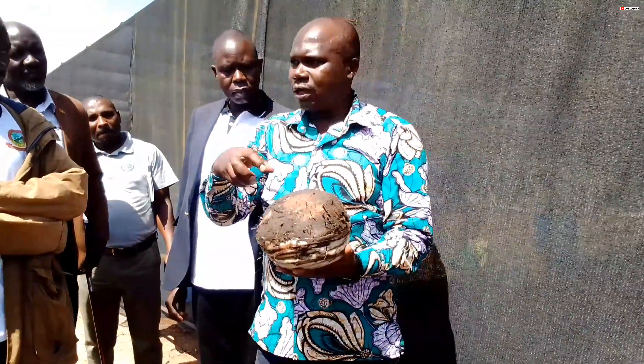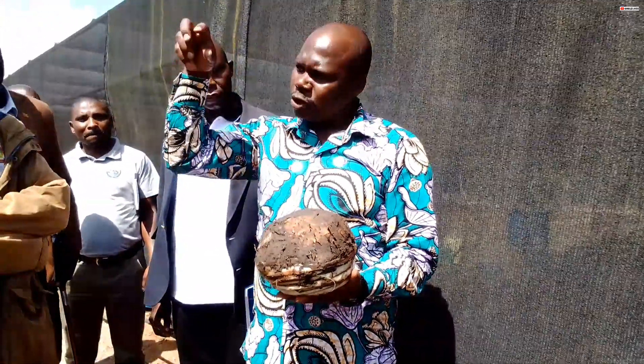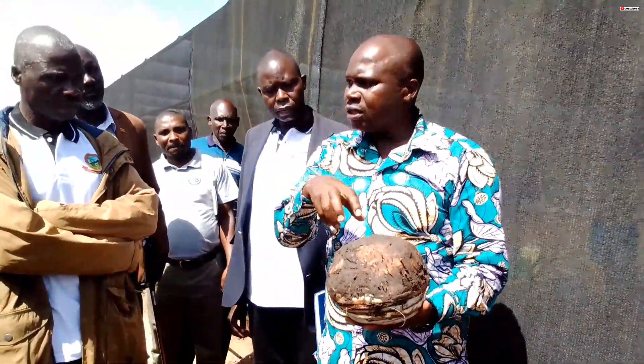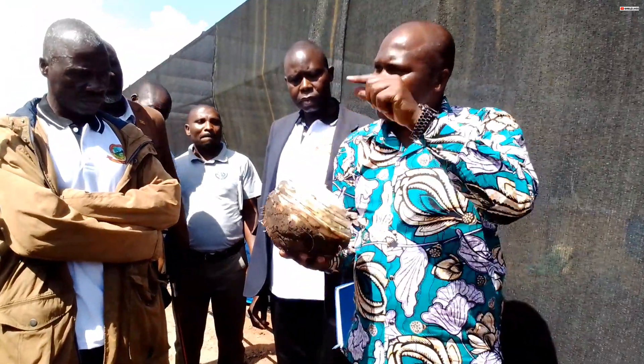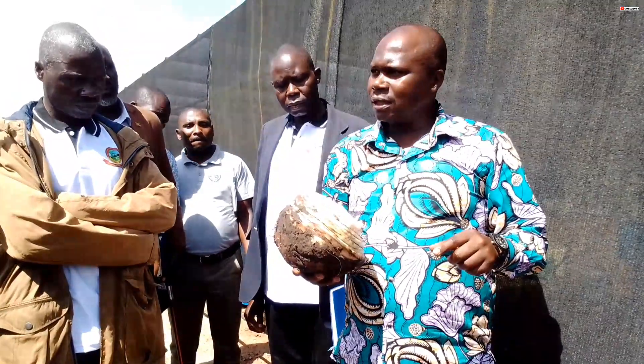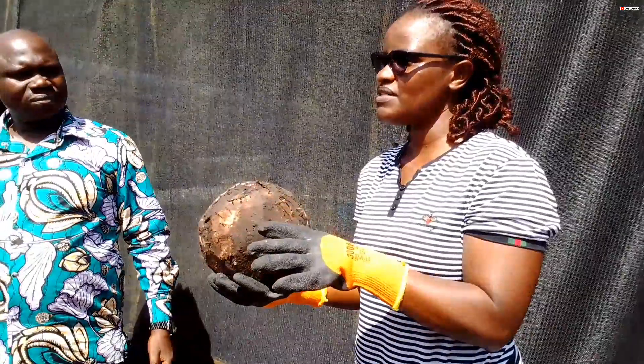When you look at those combs, there are some which have tunnels or holes that have been made by banana weevils. So there is a possibility that there are even eggs inside this one. That's why we are disinfecting it. But even when they are preparing, we make sure we don't include those which are damaged.